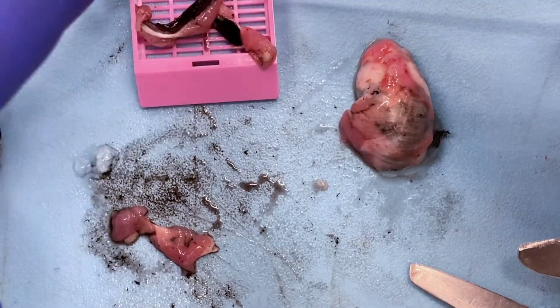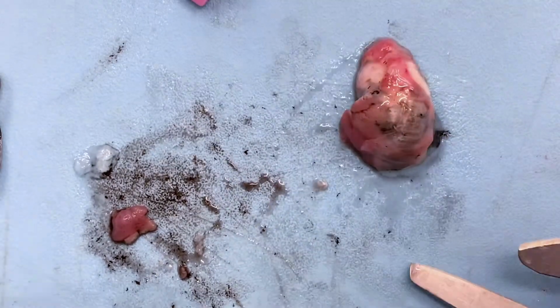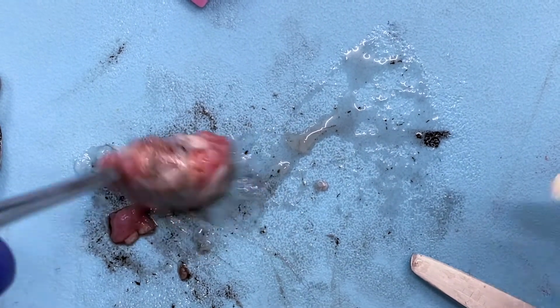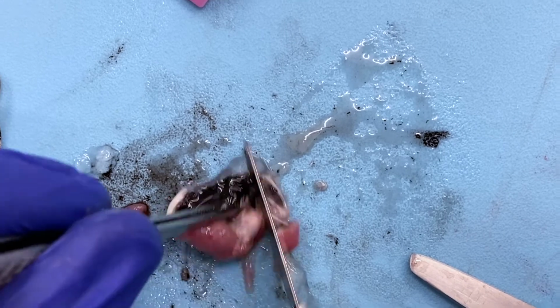A little sticky there. Some of that vitreous fluid is left. And then we would do the same with the opposing side. This one is a little bit thicker, but we'll make do. Obviously, we want to make our sections as thin as possible.